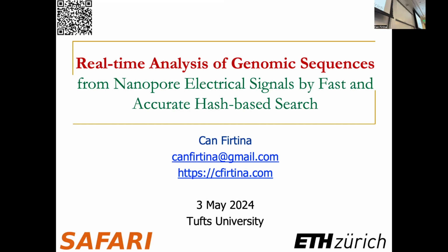Exactly. So how did that actually work with one single value? Maybe let's go back. How large is the entire search space? If you're referring to the entire reference genome, or to the number of bits that we're allocating for hash values.